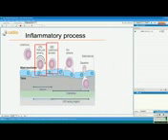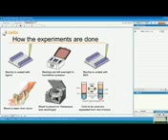This is where chemokines and integrins play a significant role, and leukocytes switch into the activated state, which allows them to successfully adhere to the endothelium. Following that, the leukocytes firmly adhere via LFA and alpha-4 integrins, which leads to transmigration of the leukocytes under the influence of chemokines through the endothelial layer.